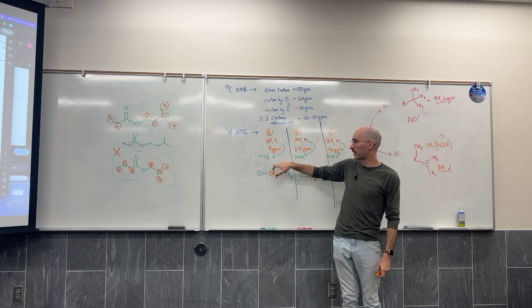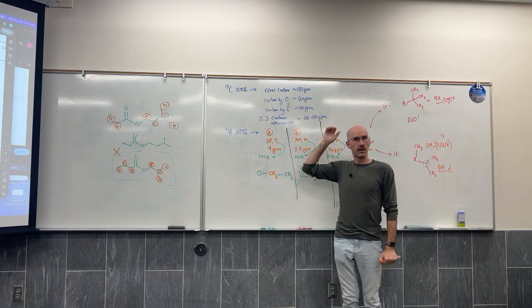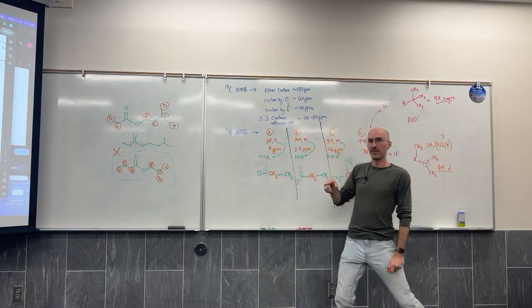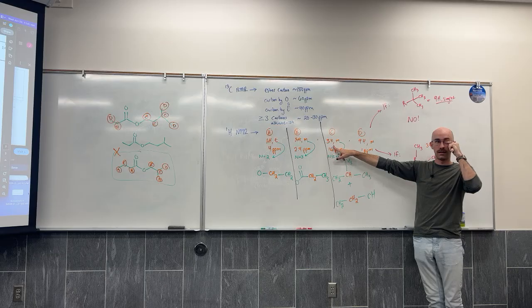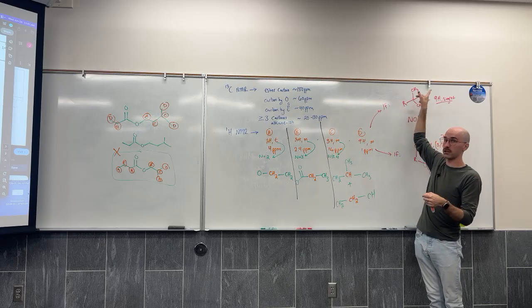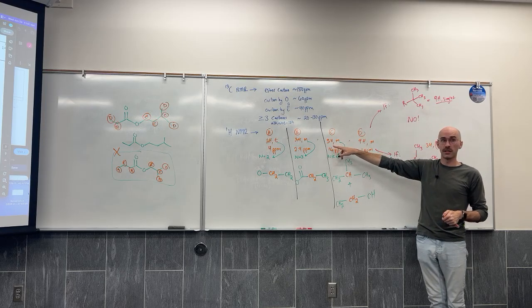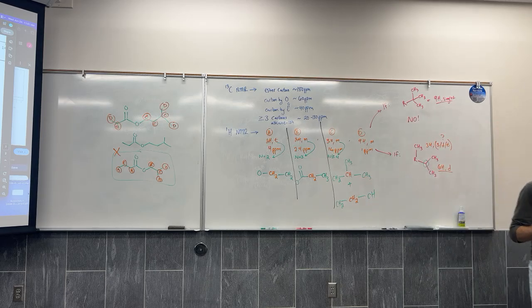So to have a splitting pattern, those two hydrogens must be attached to something, and they must be attached to a carbon. However, 3H here, which I had mistakenly written as 1H, is not 3 identical hydrogens. Although we do often look for CH3 groups, this 3H could only result from the overlap of a 1H and a 2H. So signals often have an integration corresponding to the number of identical hydrogens, but they don't always.